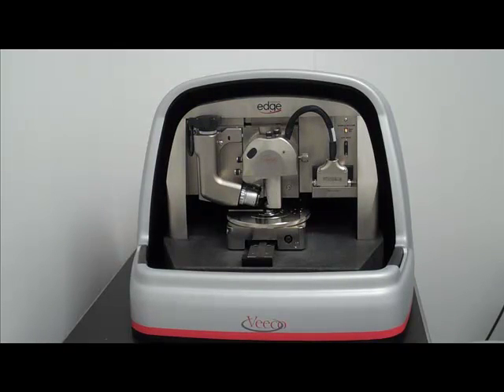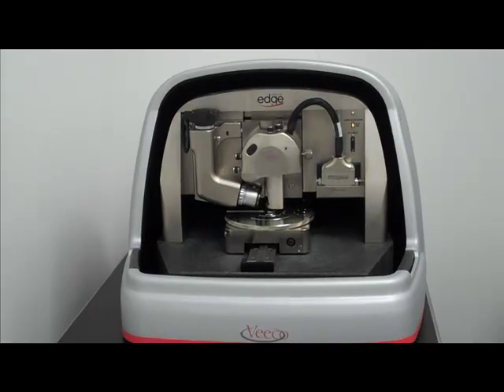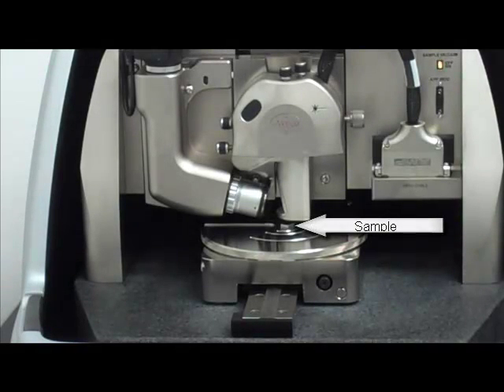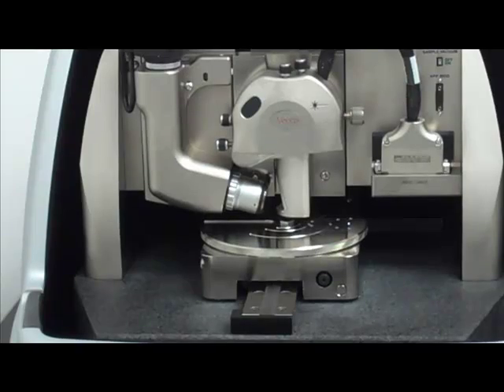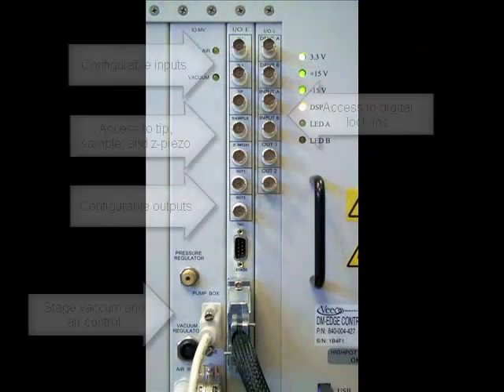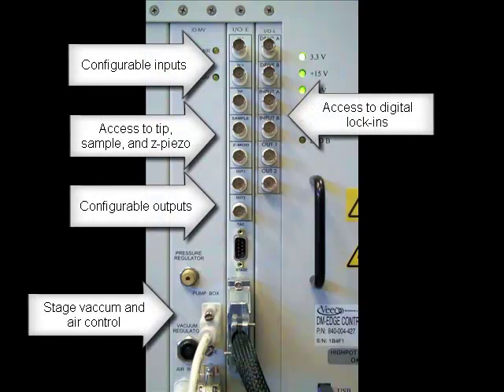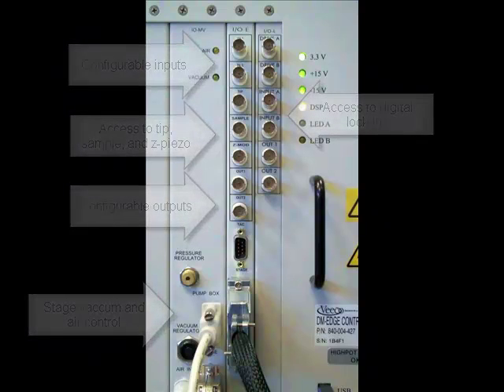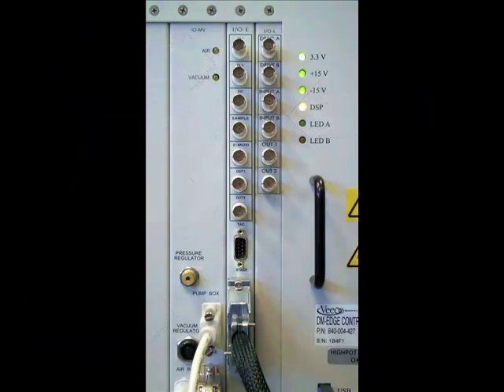When we zoom in a little closer to the tip area, we can actually see a small sample mounted underneath the tip. On the back side of the controller we have a dozen or so BNCs which can be used to input or output a variety of signals to the Dimension Edge system. The only connection from the controller to the computer is a simple USB cable.